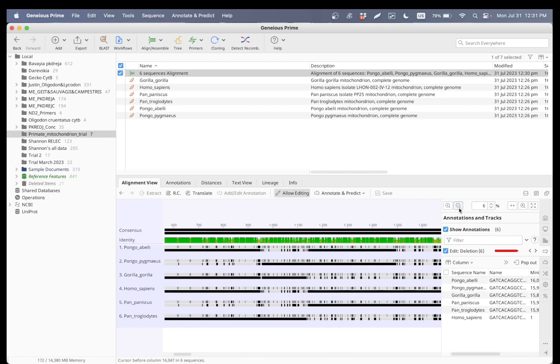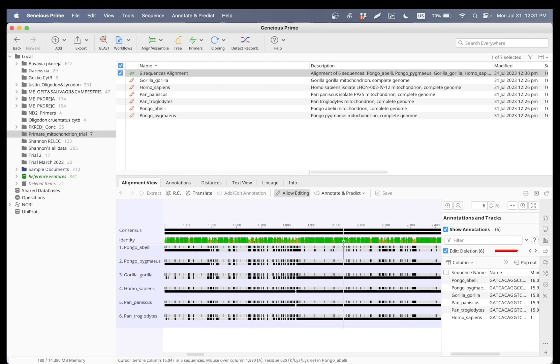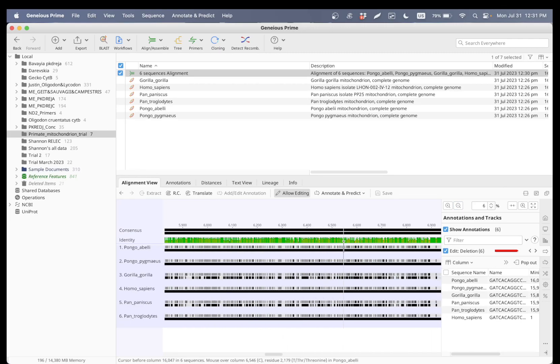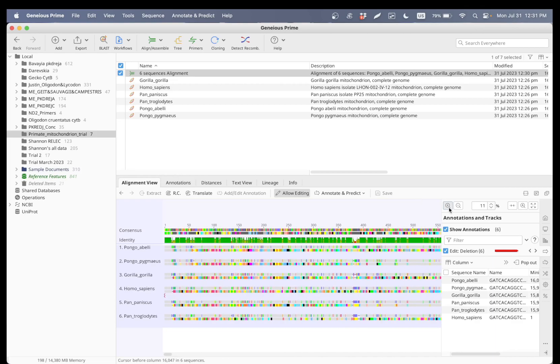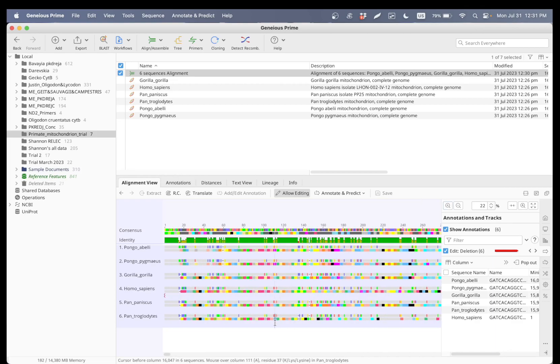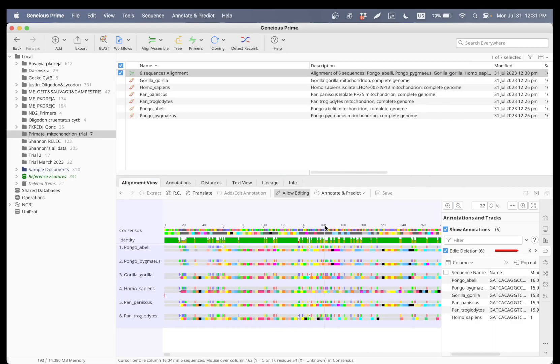Within these six specimens, and this is how you align the sequences. Thank you.